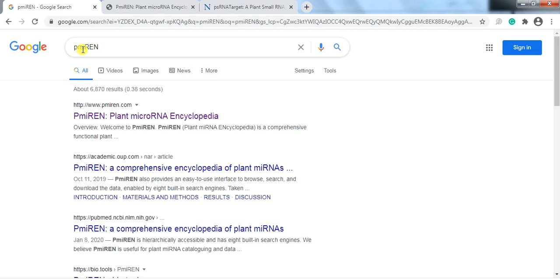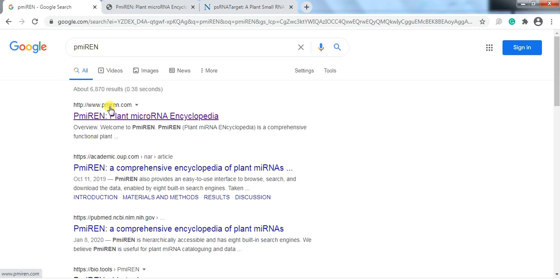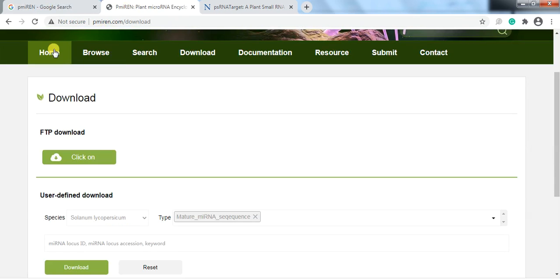Write 'Plant MicroRNA Encyclopedia' or 'PMiREN' in Google and open the first link. When you open it, this type of window appears.